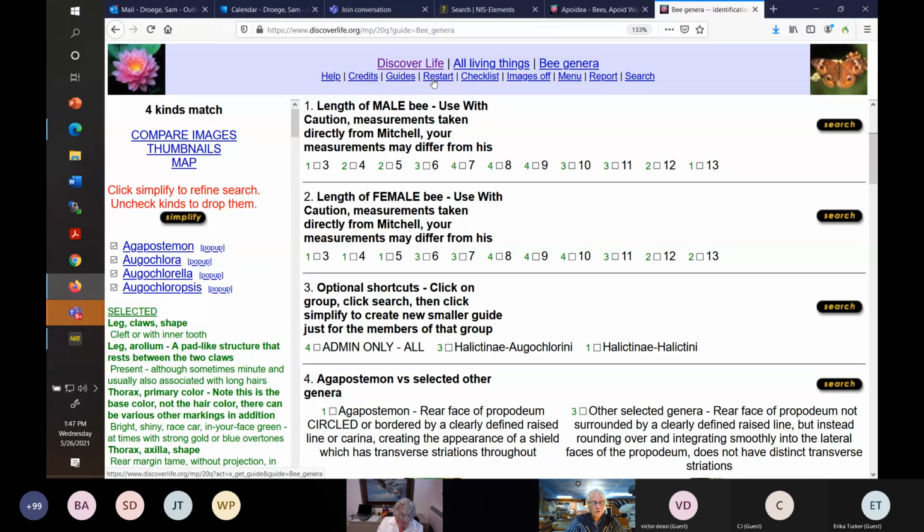To put it down. Just put it down and go to another one, because by plowing through a whole bunch of specimens, particularly if you know what they are, you start to get a feel for the characters and the boundaries for some of these divisions, because the next specimen might be a way better one to illuminate that. And you'll start seeing patterns like, oh, I'm seeing a whole bunch of this one kind of thing. I know a little bit about bees, and I know that this genus is very common, so that might be more likely it. You just want to continuously turn over specimens and look at a lot of them when you're starting out.